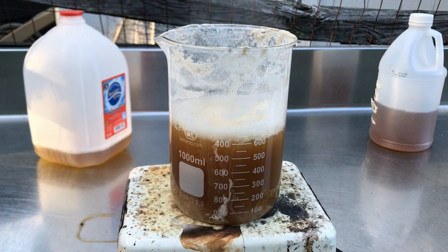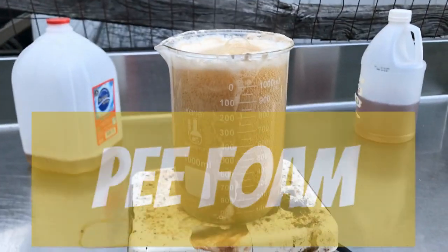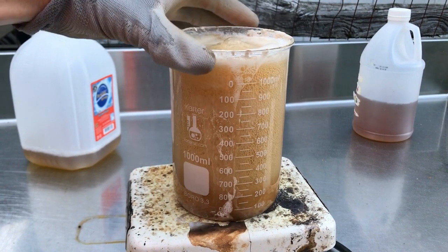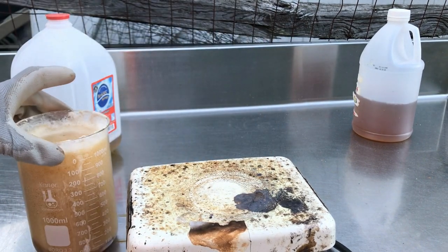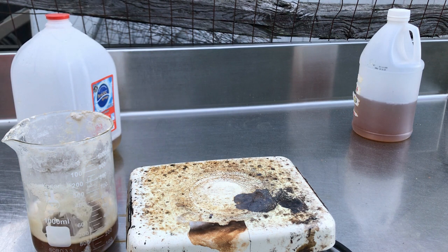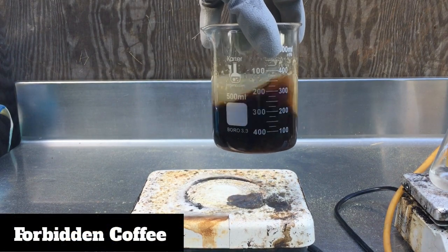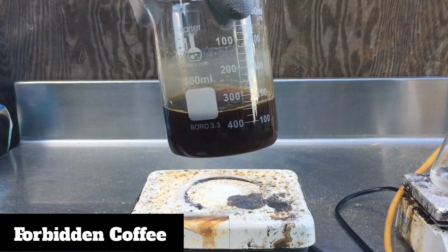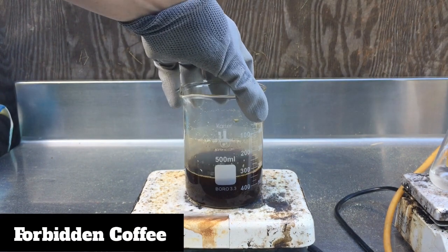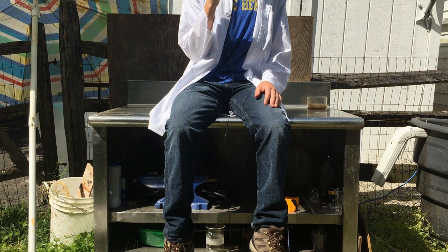We start boiling the pee down and when it gets to around 200 to 300 milliliters it really starts to thicken up. We see a lot more foaming and this is also when we see a precipitate of what I can only assume to be minerals that settle to the bottom of the beaker. At this point I let the precipitate settle and decant off the black liquor that is our solution. This concentrated pee goes into a separate beaker and we repeat the process again and again until we concentrate all of our pee into a very thick black mass of concentrated urine.